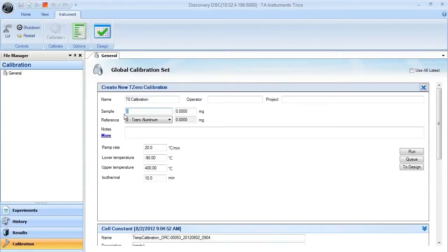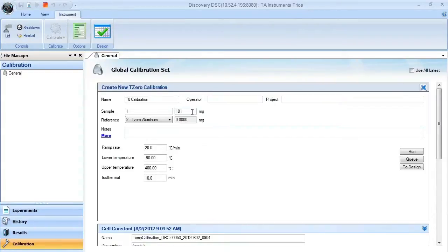Enter in the pan number of the clear sapphire, and make sure to enter in the exact weight of your clear sapphire in this box here.